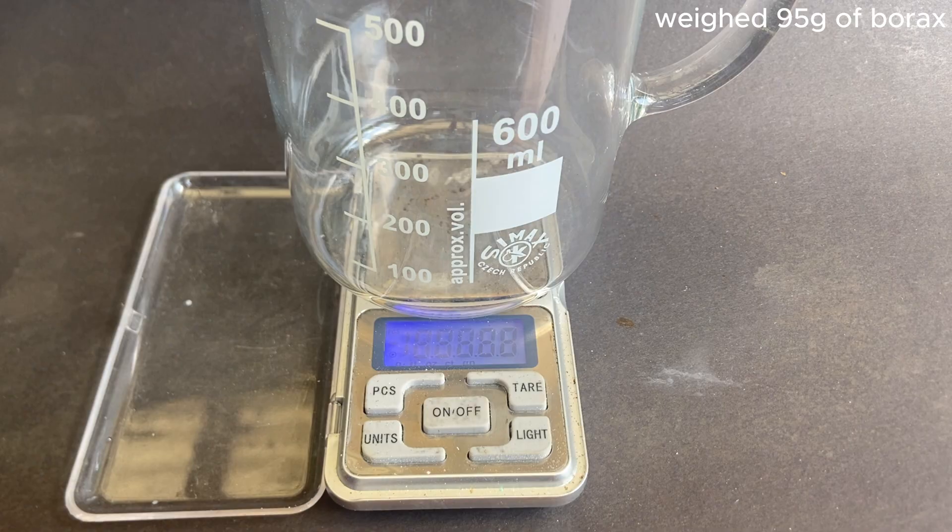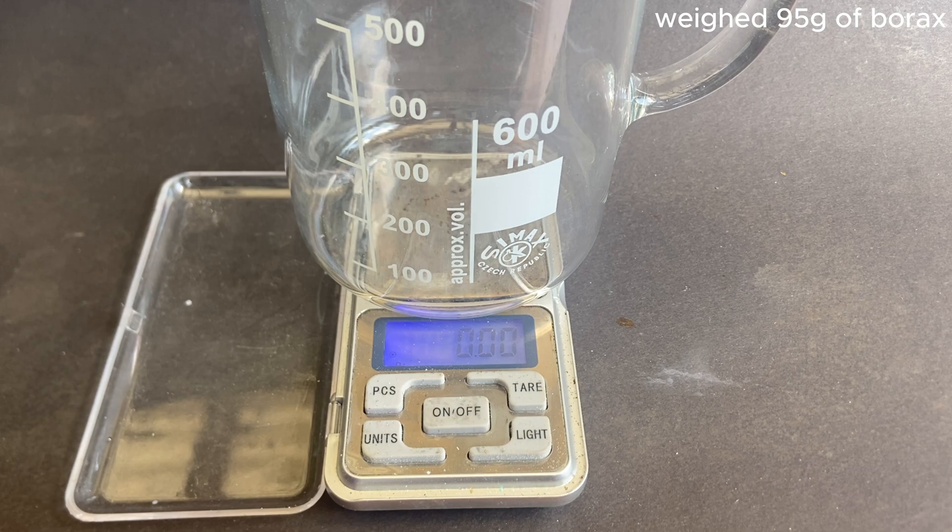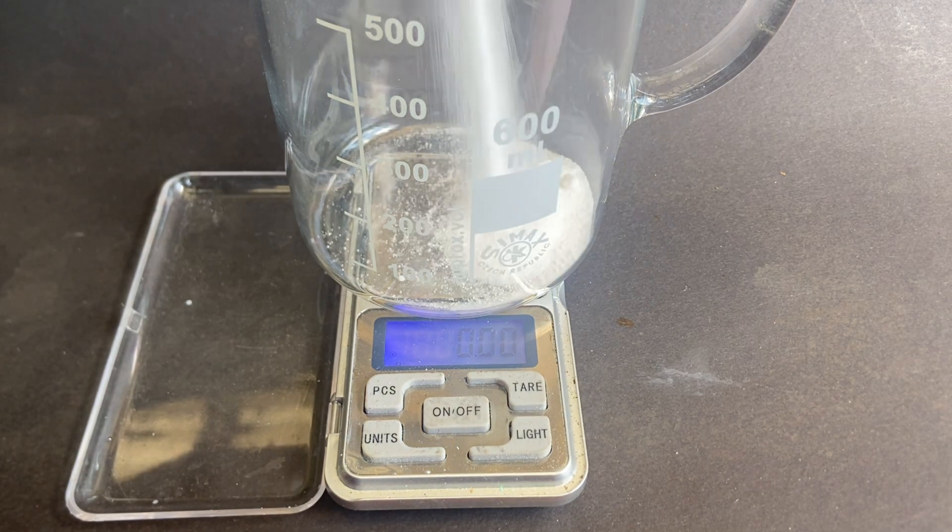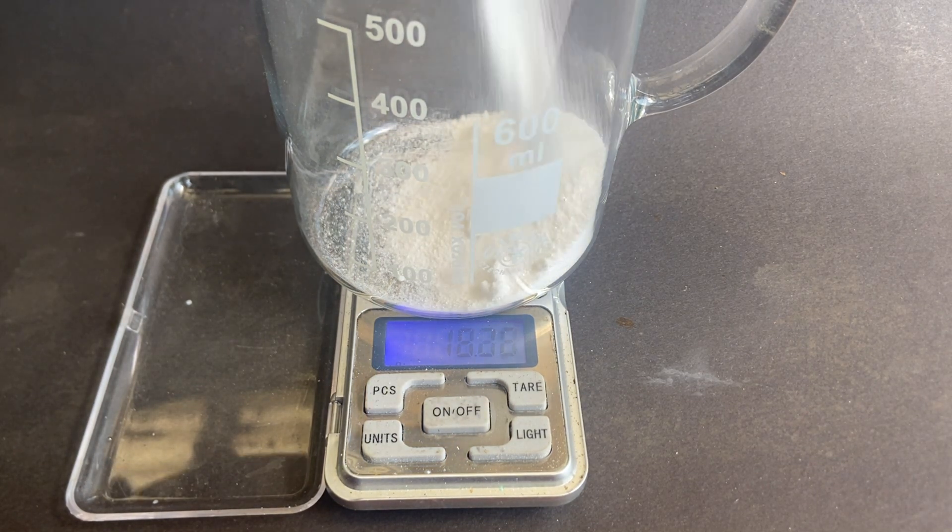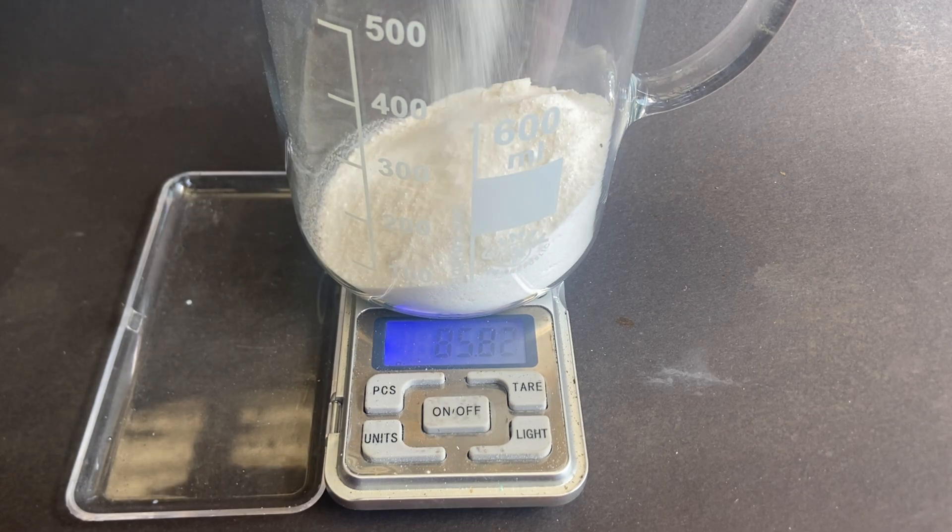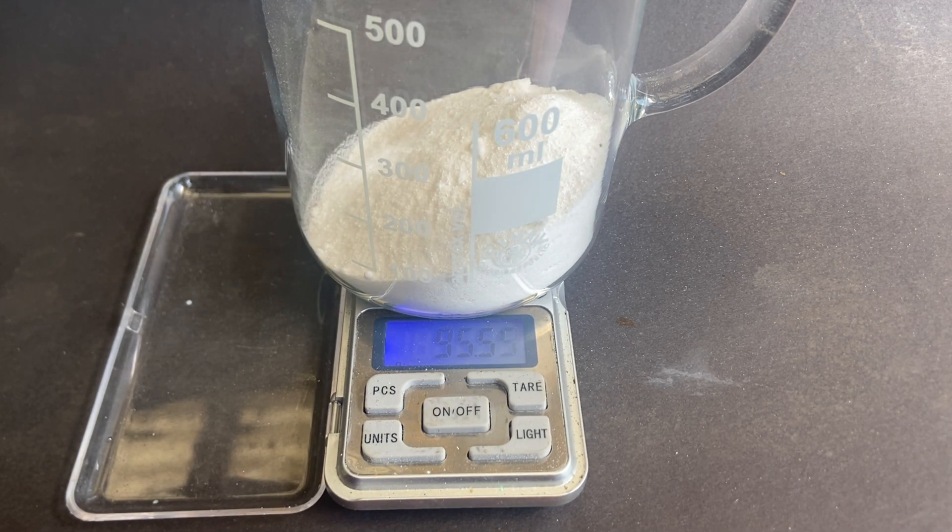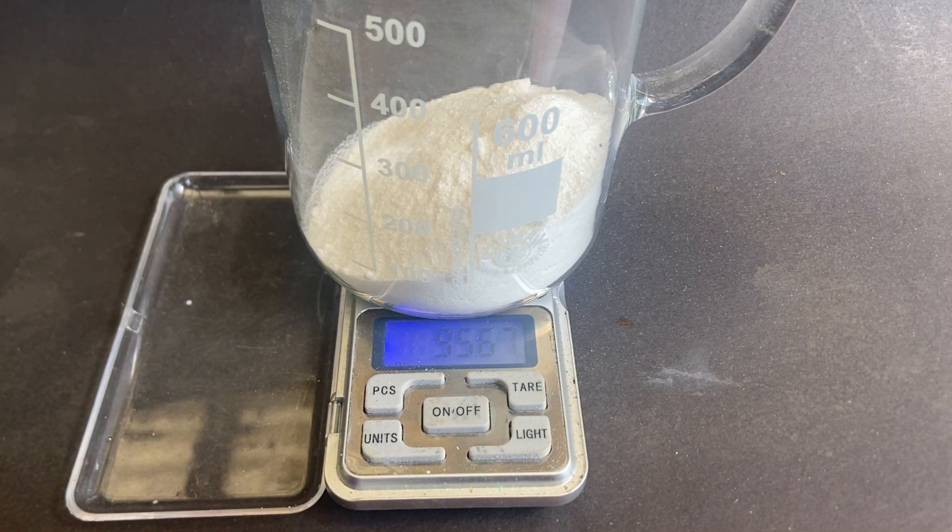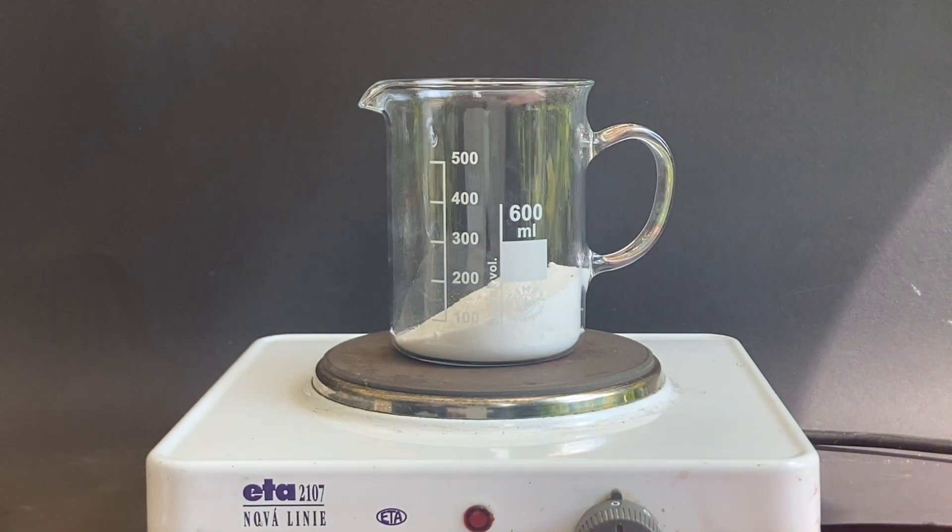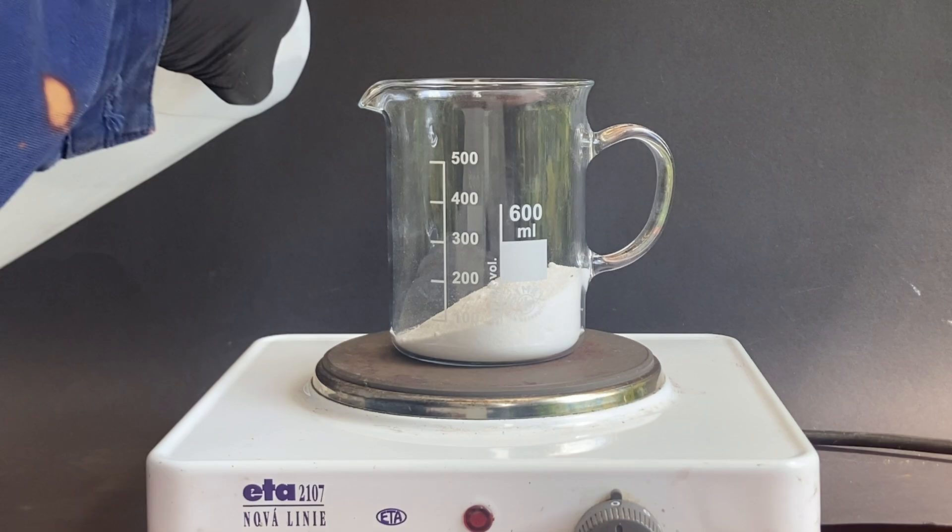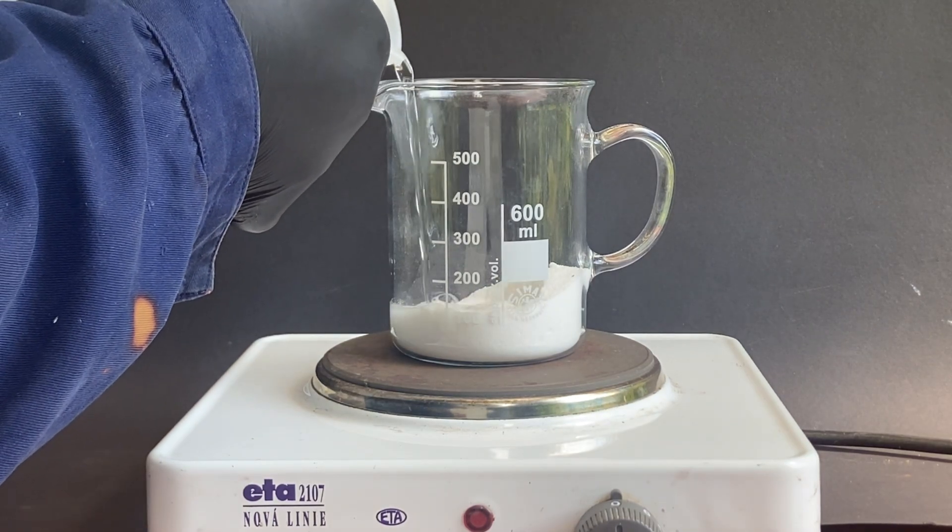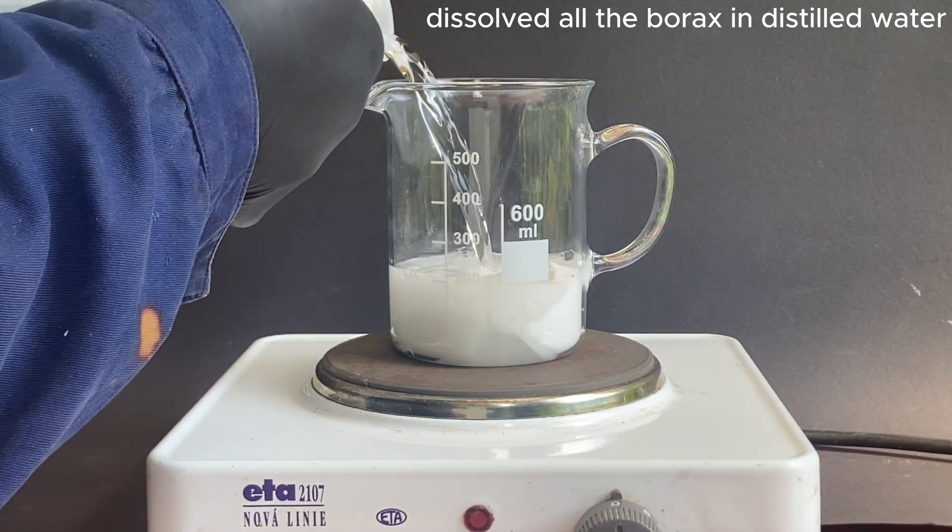In today's video I will turn borax into the element boron. First I weighed 95 grams of borax and added around 400 ml of distilled water.